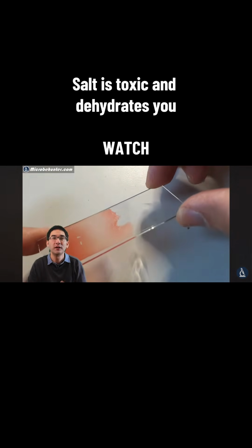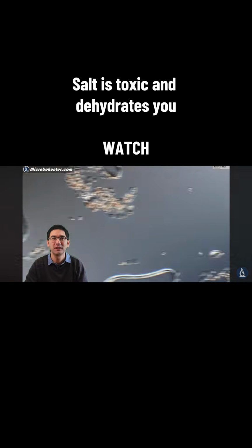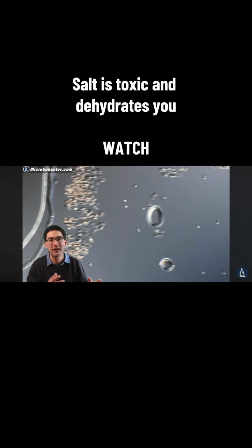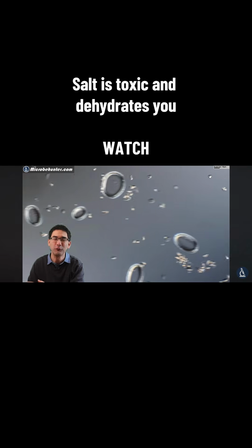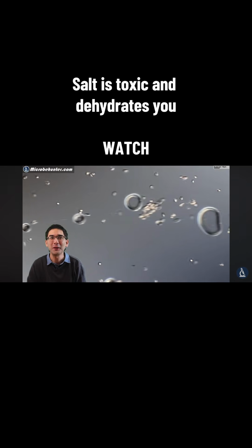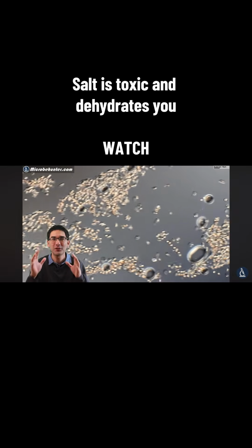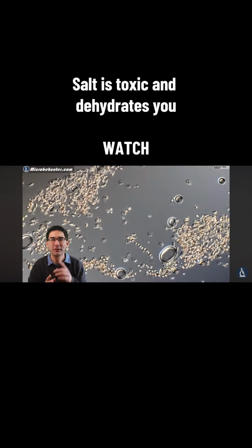Then this is when essentially the salt water was able to do its action, and by osmosis the blood cells started to lose water, and as the water streamed across, I was trying to follow along some of those red blood cells. Off we go. The movement was so quick that I was not able to see the change in shape, but then I stopped the microscope slide and looked carefully.